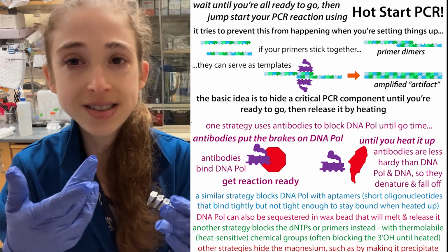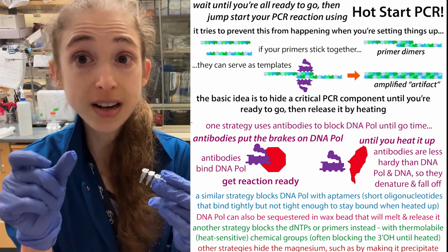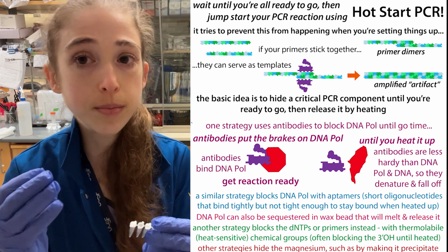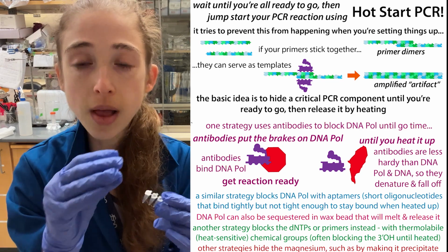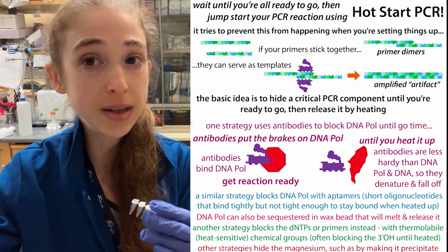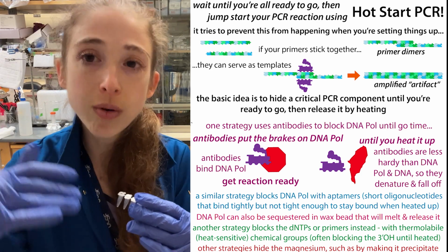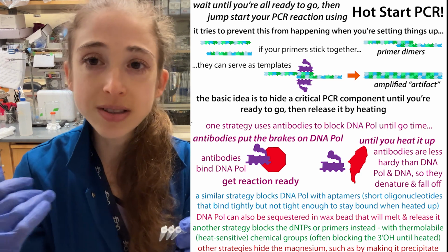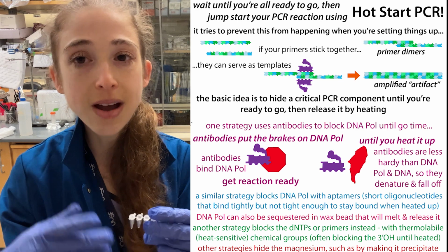And remember, we just said that those beginning products are really important. And so you don't want that to happen. And so a hot start polymerase basically has some sort of blocking group or something like this, where it's not until it heats up that it is going to become active. But so you can set it up at room temperature or on ice or whatever you want. When you stick it into the cycler, now it heats up.